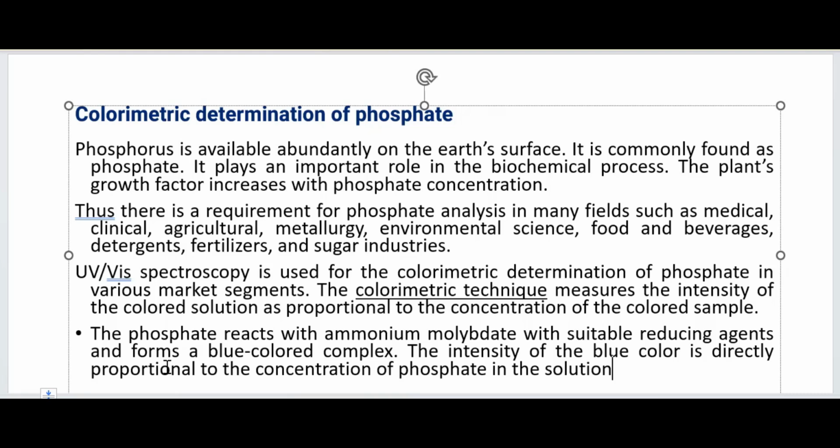We are learning it as an analytical instrument, but spectroscopy in itself is a subject and has many applications and different types. Different types of spectroscopic instruments are known, their functions are different based on the lamp source or the light source that is used, and the functionality of the entire system, but the basic components are the same. So if you have any query you may ask me right now, or else I'll conclude this session, and again we will rejoin in 5 minutes with FTIR, that is another instrument that we have to talk about today. Is there any difficulty?